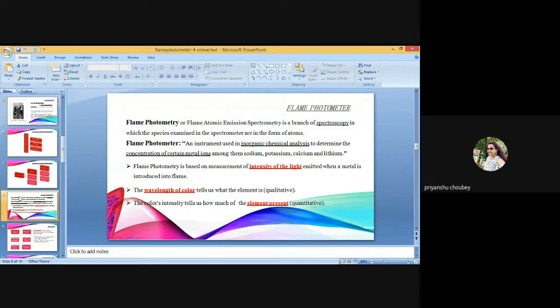In case the instrument shows a sign of over-range error, appropriately dilute the sample considering the observations of the sample and feed the diluted sample.